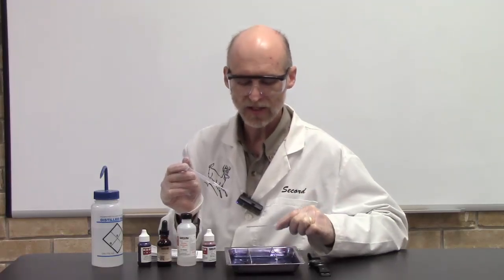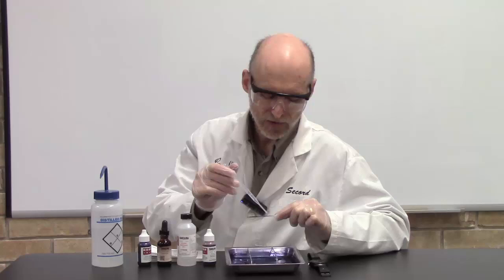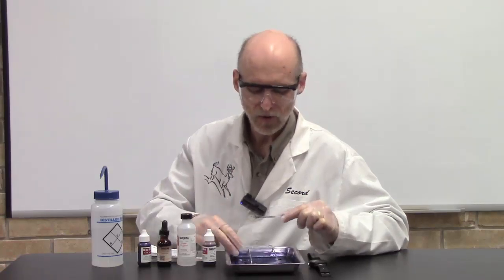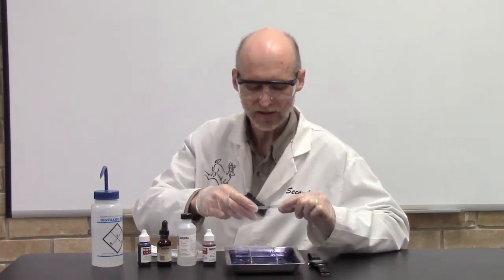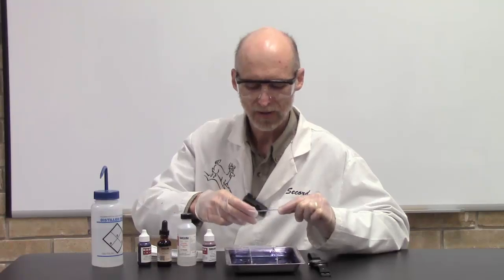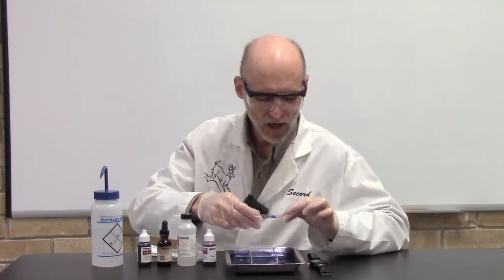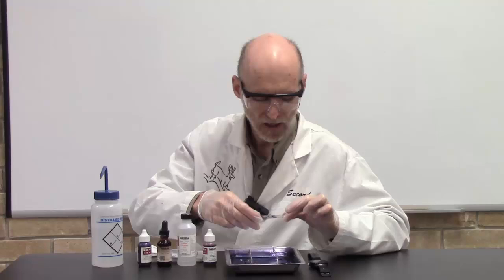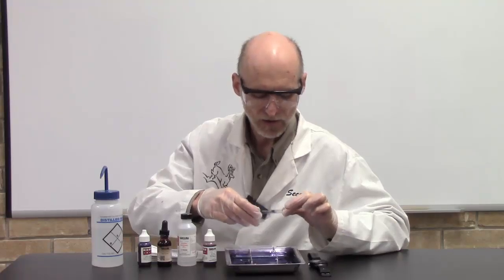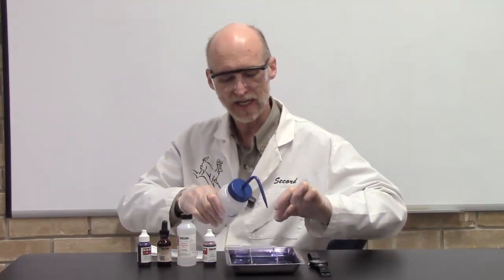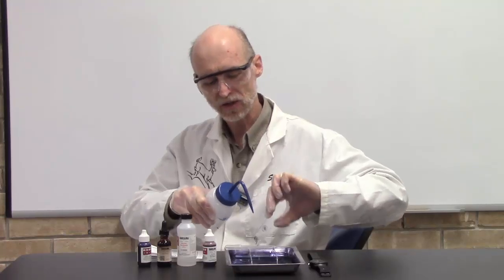This is where we're going to decolorize the thin cell walled bacteria but not the thick cell wall. We need to leave it on for just the right time. Put a couple drops on your bacterial smear and rock it back and forth. You'll actually see the stain coming out. Really watch your clock to make sure you leave it on for exactly 12 seconds, and then immediately rinse it off.